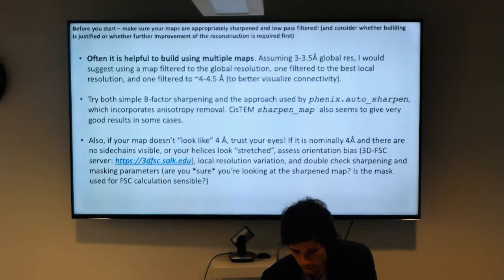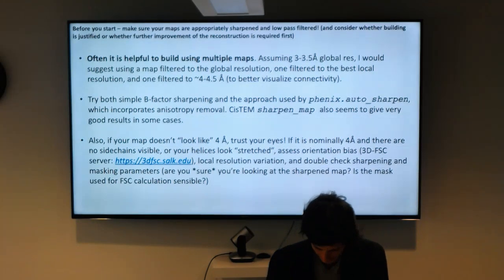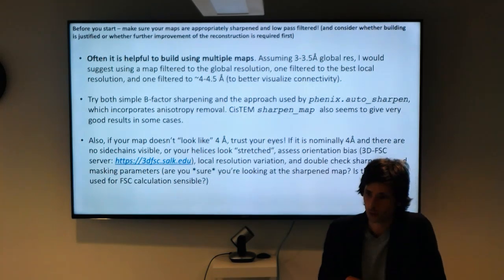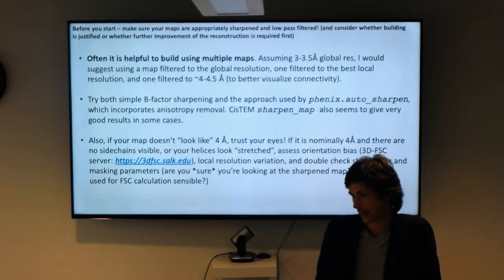Okay, so before you get anywhere near looking at your map, what you want to figure out is what information you can obtain just by analyzing your protein sequence.